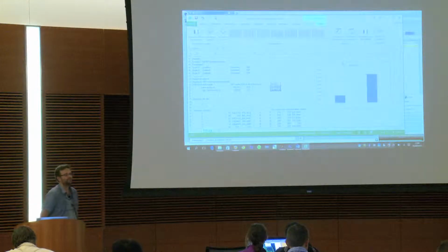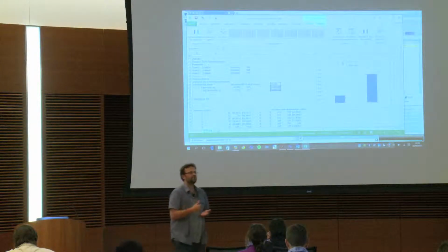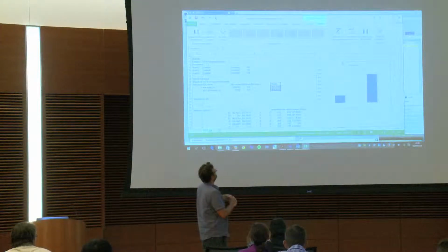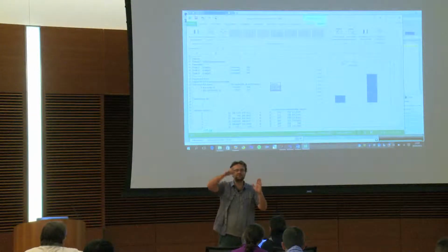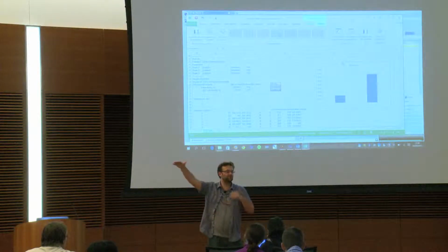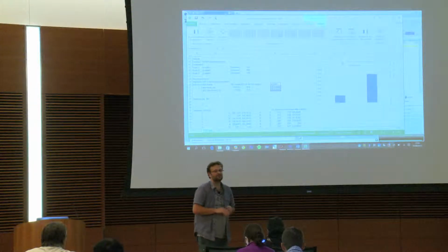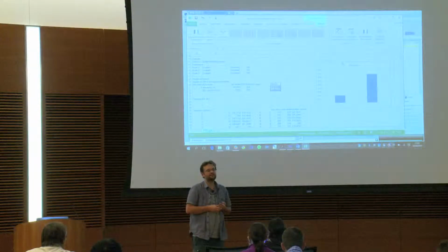I have this, okay? So usually if you do the same thing, I ask you your numbers. And when we do this, we see a lot of differences, meaning that for the high density, all the values that you're going to provide are going to be very jumpy. And for the low density, they will be about all the same. So why do we have different results? Because in fact, we are working with the same algorithm. We didn't change any parameter, but we have different results. So do you have an idea about this?